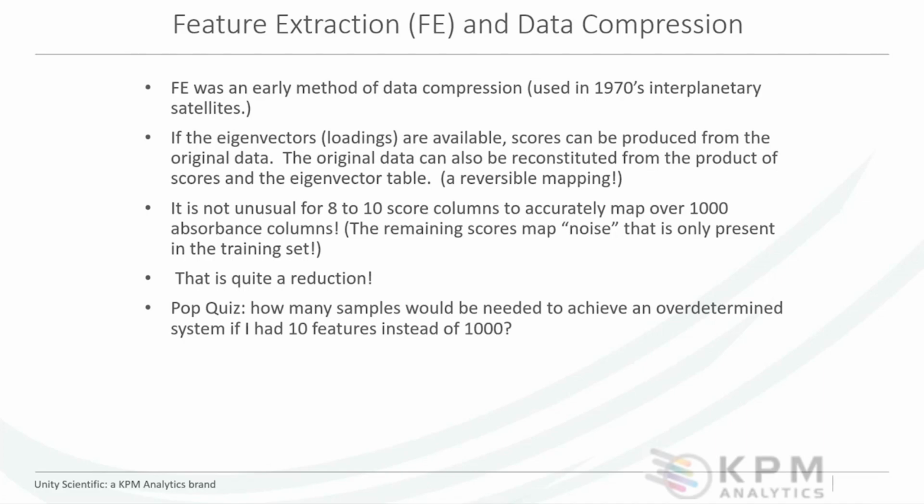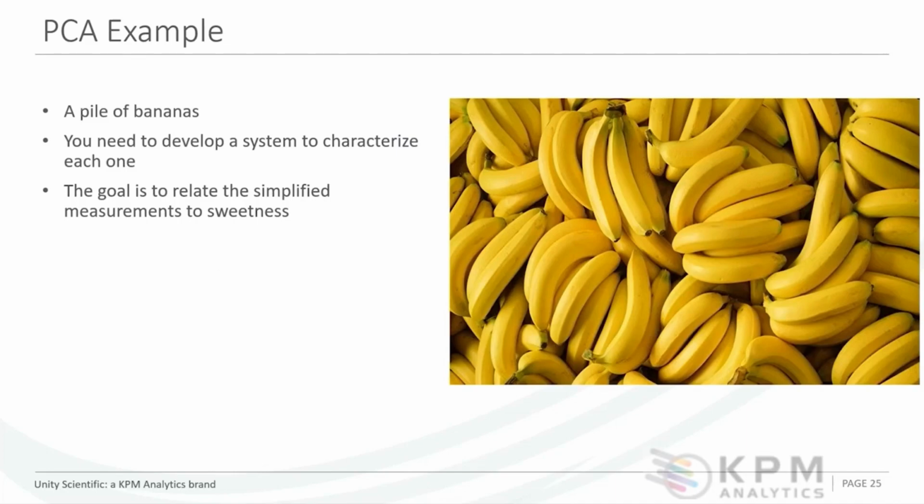This is a pretty simplified illustration, but it shows how data compression and these mathematical reduction techniques can take an unsolvable and massive data matrix and bring it down into a reasonable scale that we can then use for calibration purposes. When I started in near infrared, I had multiple really smart people try to explain principal components and data reduction to me. And on the second or third explanation, I think it started to take hold. If you asked me to generate a principal component analysis from scratch, I could not, but I've gained a very functional and usable knowledge of it.